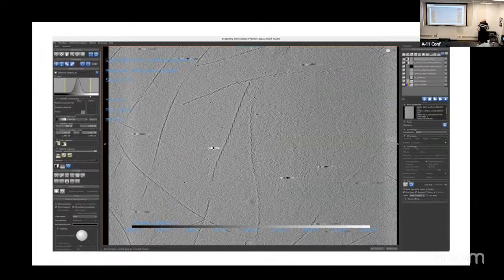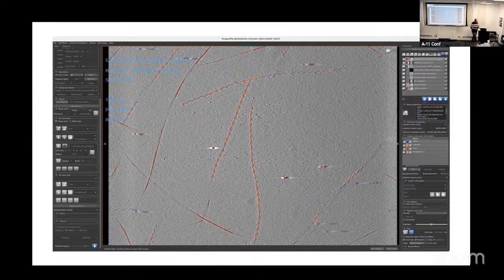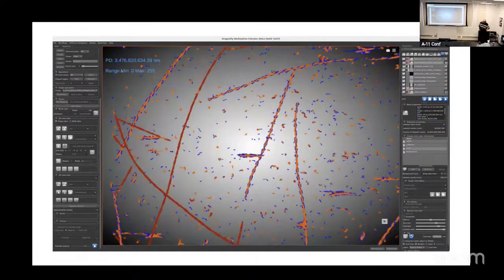And if you then take a real tomogram, this is just in vitro polymerized actin, then mixed with cofilin, you actually get this red, like the bare actin filaments get segmented as bare actin, and cofilactin gets picked up, and it actually gets these spiral cofilins around the outside. I mean, I don't know that it's literally finding cofilin, but it knows where they are. It just kind of makes me happy.